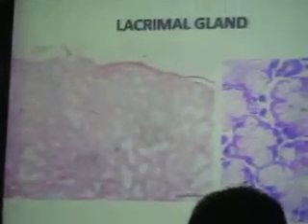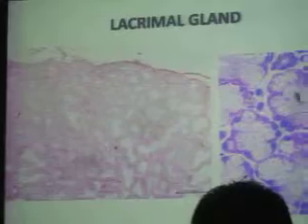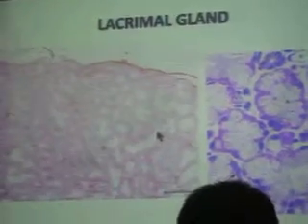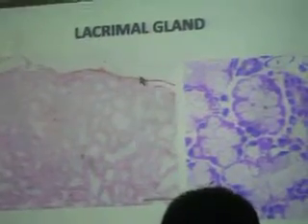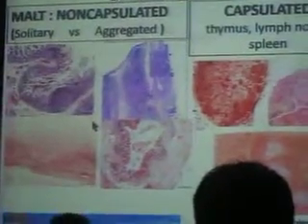So it is compound tubuloalveolar or tubuloacinar. It is likened to a parotid gland. Tignan nyo, parang parotid gland siya. You have serous gland, serous secretory cells, with granules. So it is glandular. Do you have any question with the eye and the related structures?